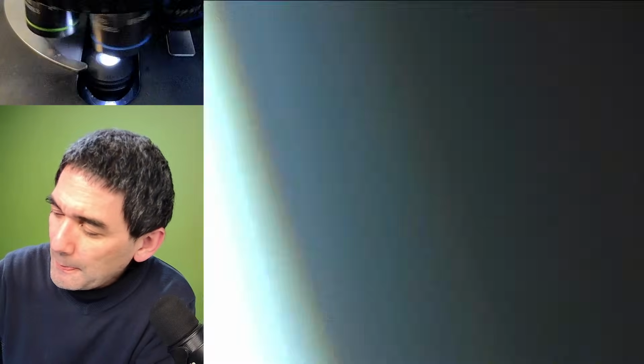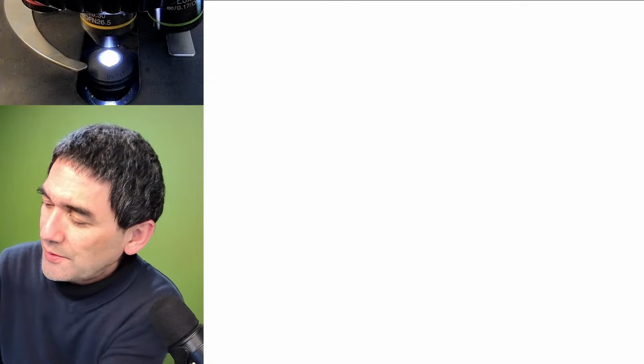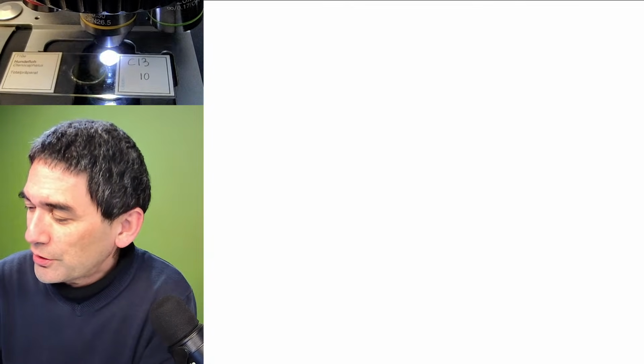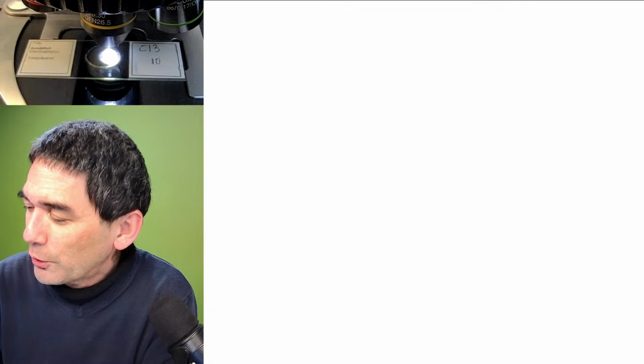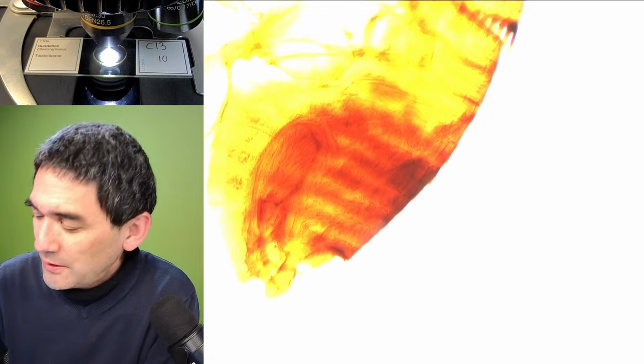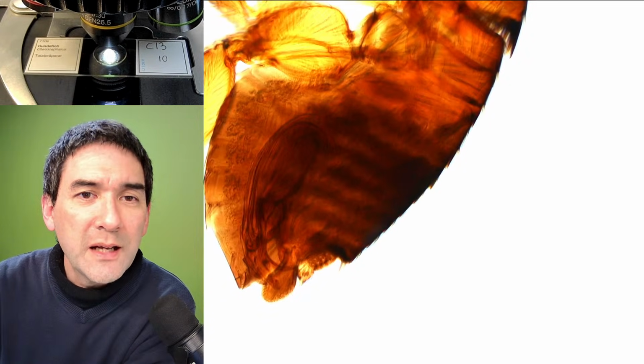Yeah, that's another favorite one of mine. This one actually, I kid you not, was featured in a BBC documentary a couple of years ago. The BBC contacted me because they found the picture of this flea somewhere on my webpage, and they asked me if they can use it for a documentary.